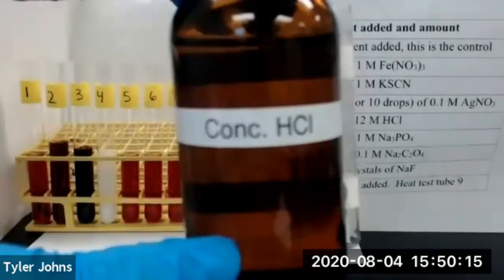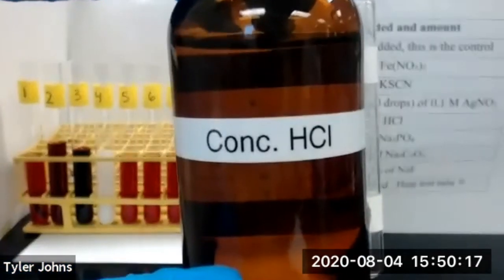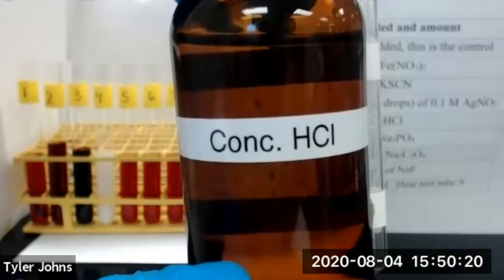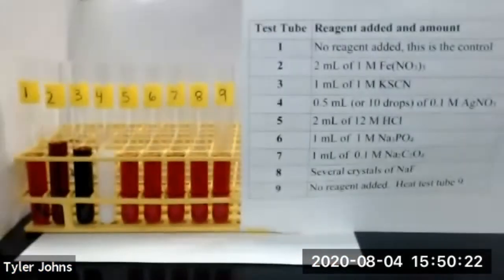We'll now add two milliliters of 12 molar hydrochloric acid or concentrated hydrochloric acid to test tube number five.